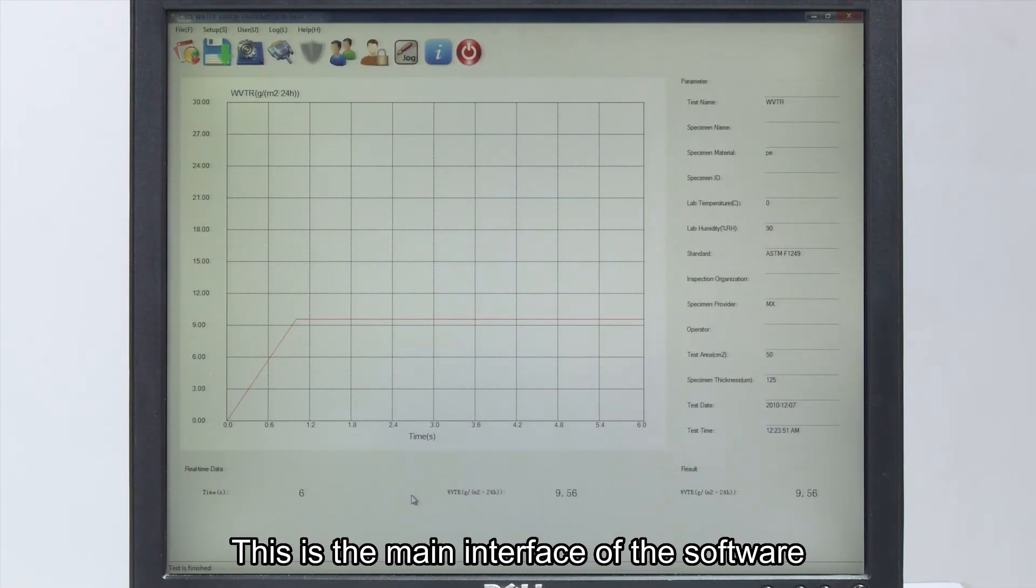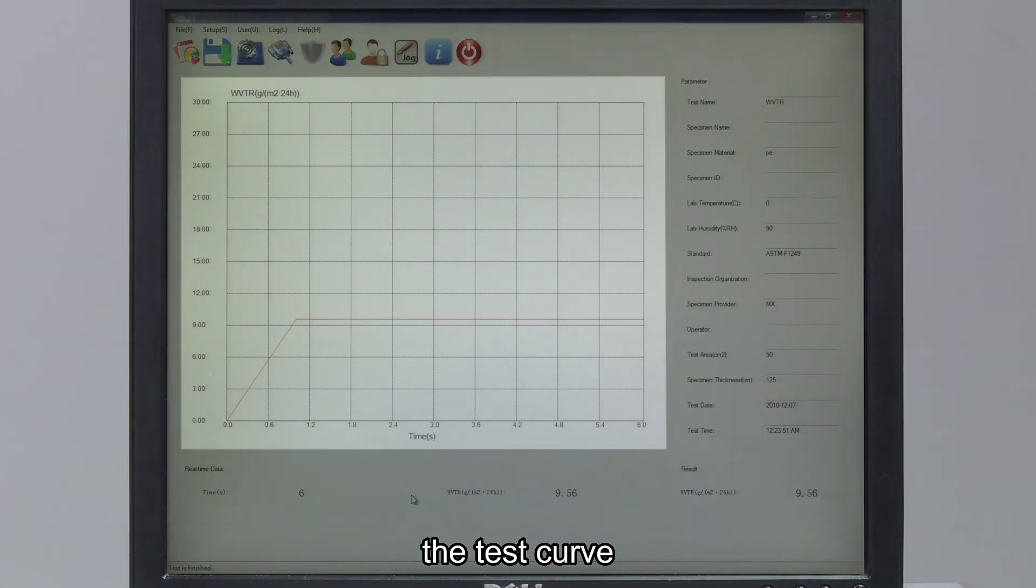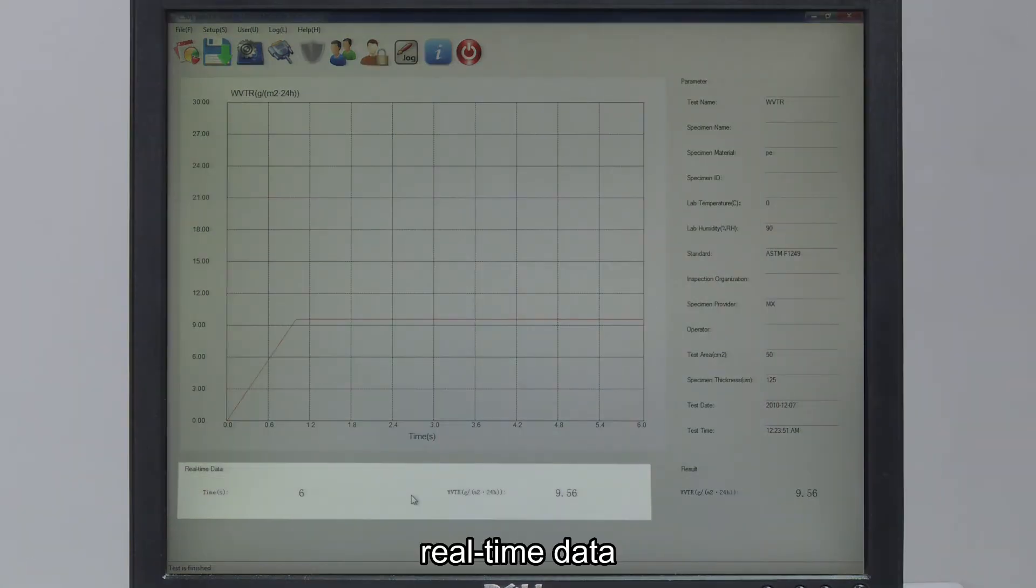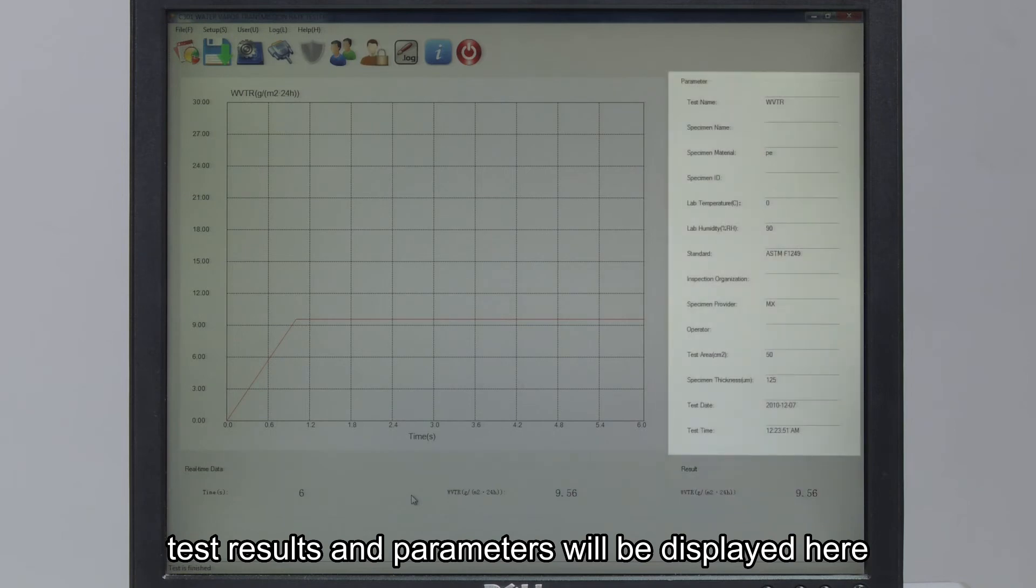This is the main interface of the software. The test curve, real-time data, test results, and parameters will be displayed here.